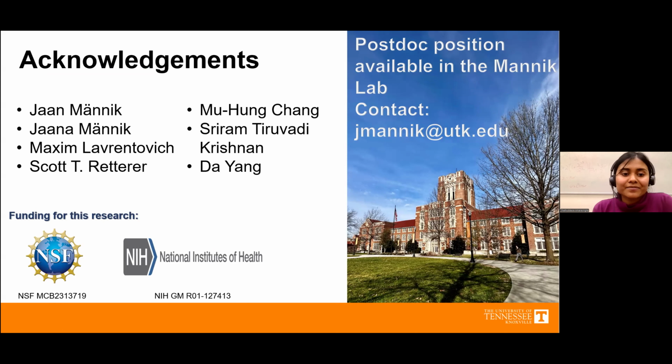Thank you so much, Chat. That was an excellent talk. We do have one question in the chat. How is cell cycle stage determined in these studies? Are there chemical measures, or is it done with imaging from visual cues or just from timing?